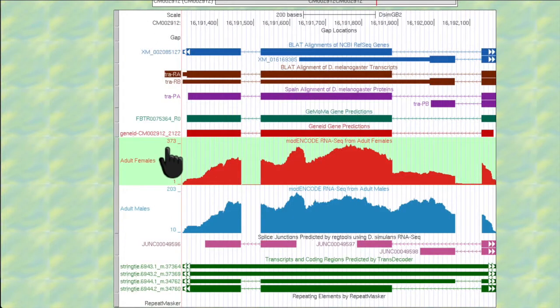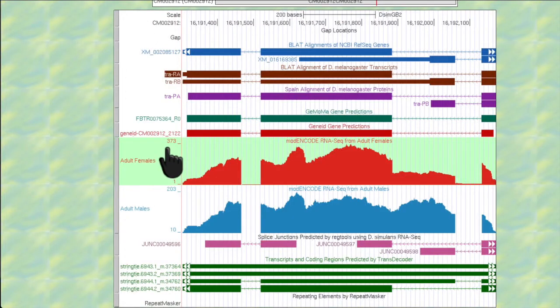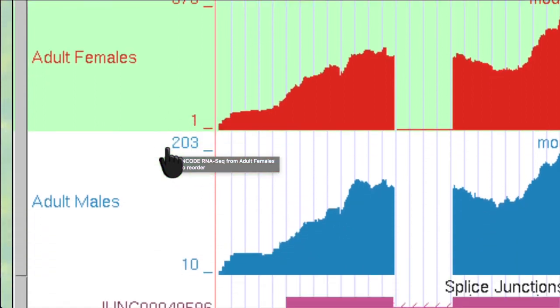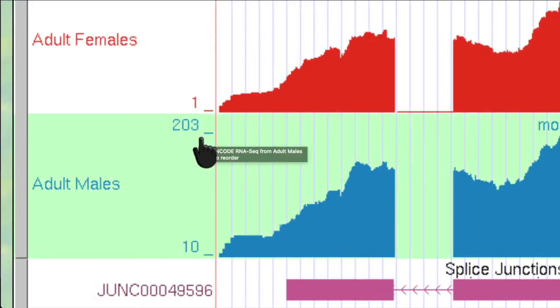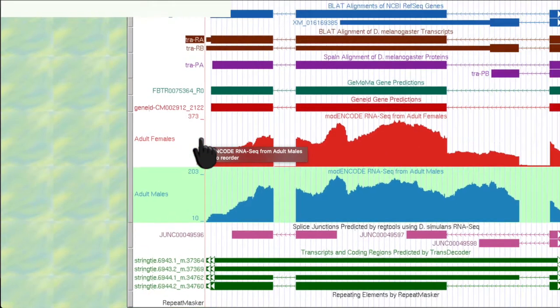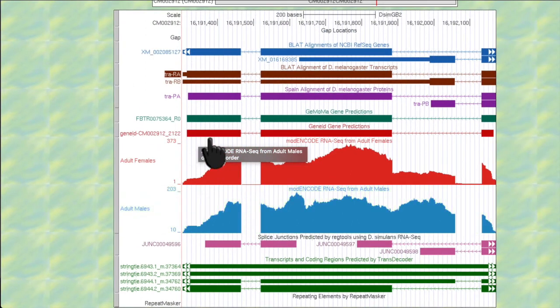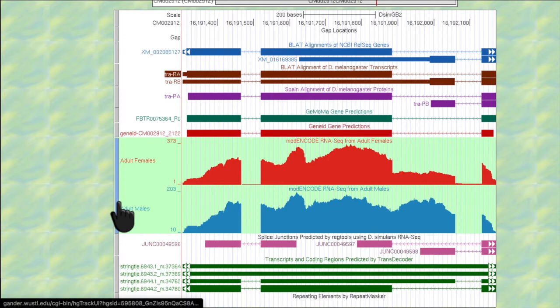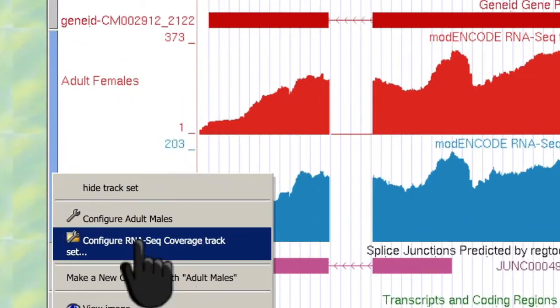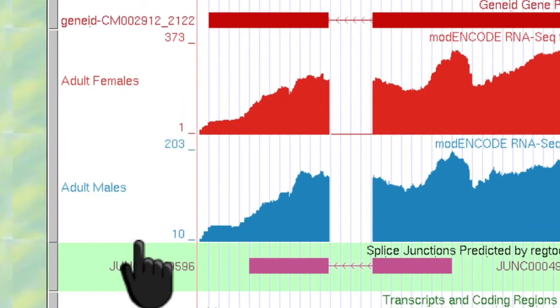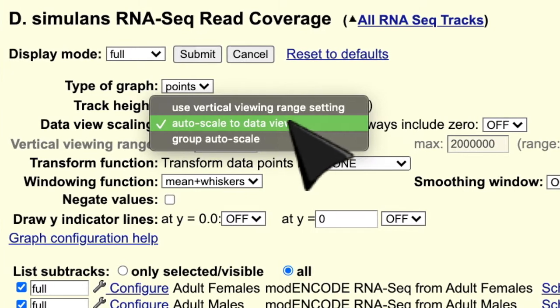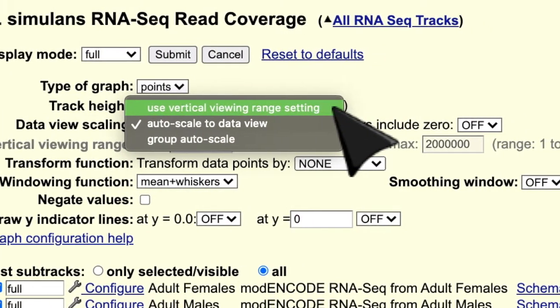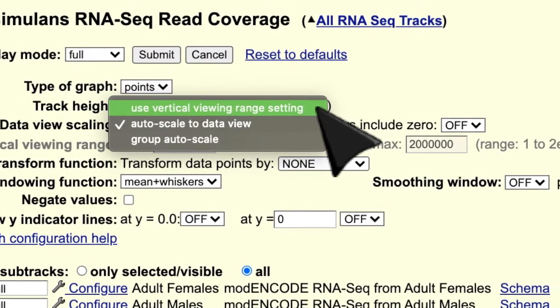This one is probably going to be the most useful to configure. By default, the label on the y-axis will be representative of the maximum amount of reads in your current viewing window for each track. So if you want to see the heights of your tracks represented true to scale in relation to each other, you're going to want to take note of the largest value in your desired viewing window before coming to this page. Once you have it, go ahead and change the data view scaling from auto scale to use the vertical viewing range setting.